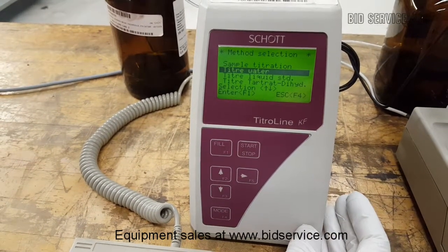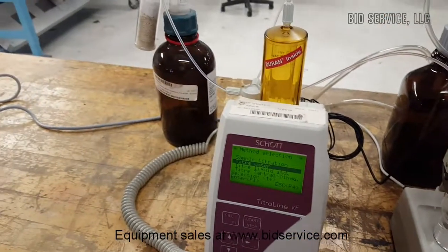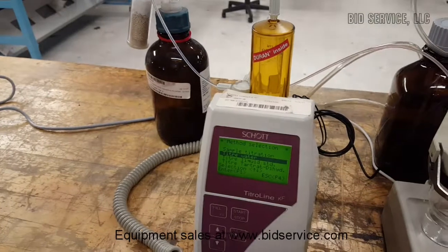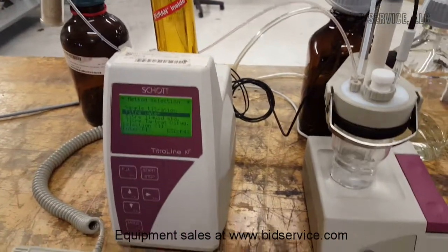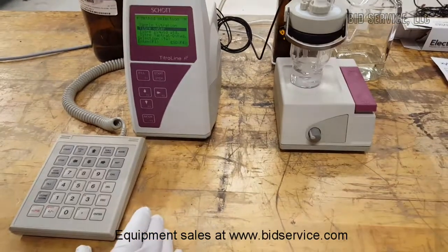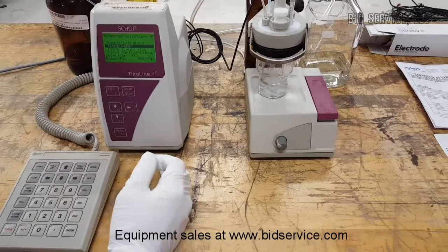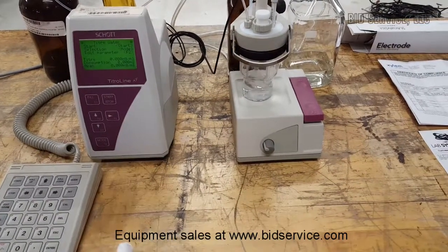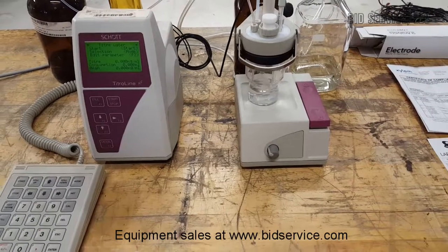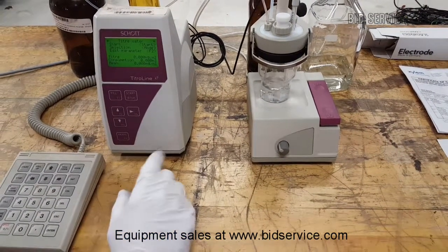Again, we don't have the proper titer here — it's just the DI. I just want to show that it will flow through the system and that we'll get a reading on the electrode. So we'll go ahead and run that by hitting ENTER using the keypad here. Or you can use the buttons on the front of the Titroline KF.